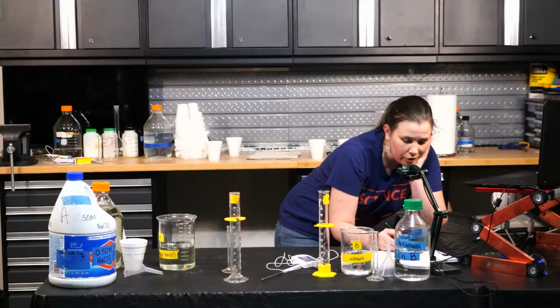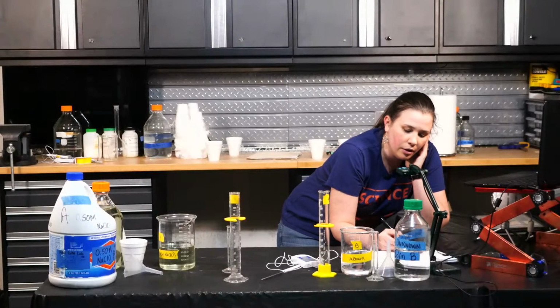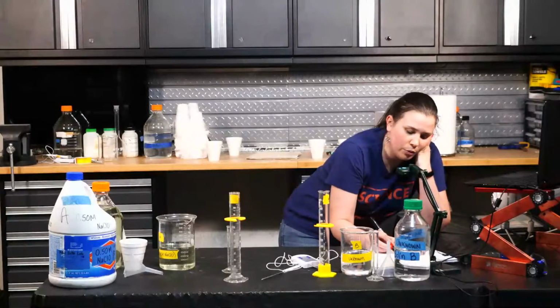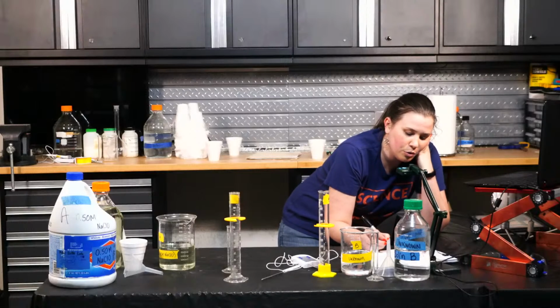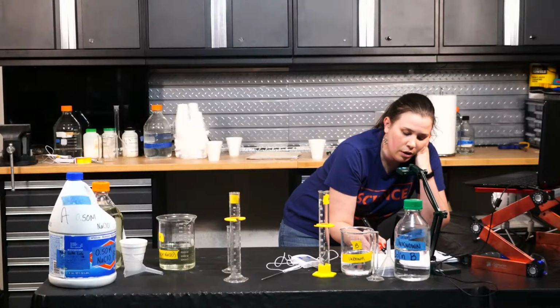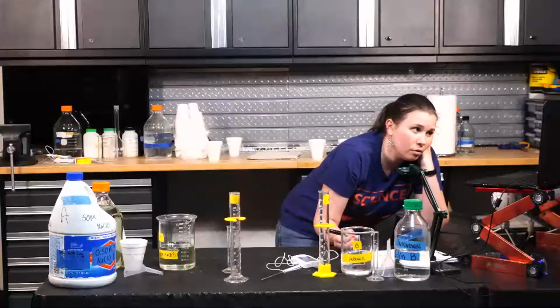Could you explain it one more time? Absolutely. So when I say it's a 1:2 iron to sodium hydroxide, volume-wise, I've mixed 1 mole of iron nitrate with 2 moles of NaOH. But what we want in order to have the optimal reaction with the maximum precipitate would be 1 mole of iron nitrate and 3 moles of NaOH. Okay, I think I just flipped the graph then.